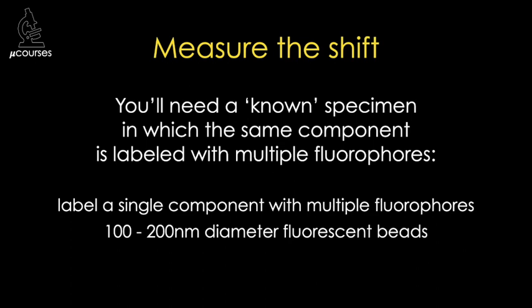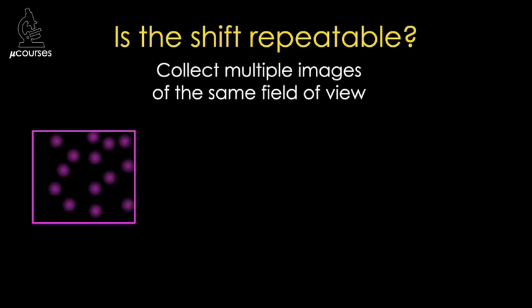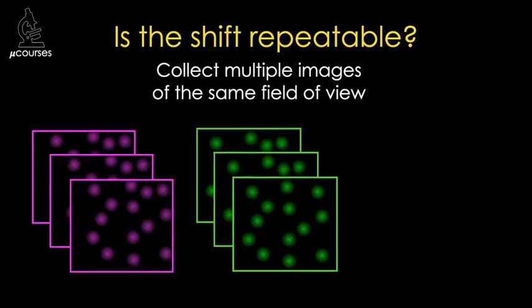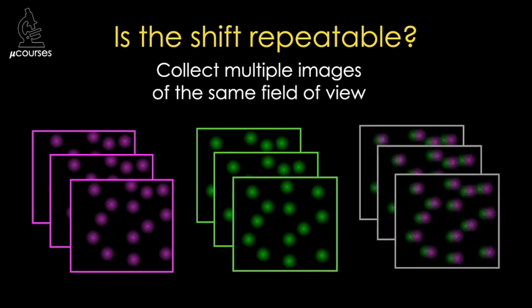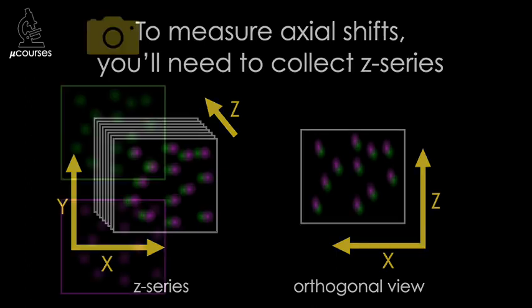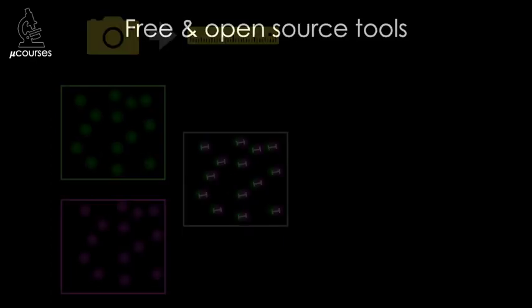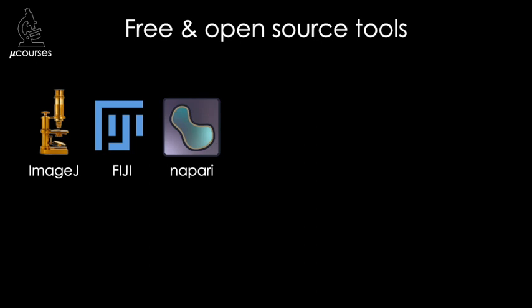Alternatively, you can purchase small beads that fluoresce in multiple wavelengths. To measure the shift, you'll take images of the test sample at each wavelength that you plan to use for your experiment. For the shift correction to work, the shift must be repeatable. To determine if it is, you'll need to take multiple images of the same field of view going back and forth between wavelengths — this will reveal if the shift is repeatable. You can use the same sample to measure axial chromatic shifts, which requires collecting multiple Z-series of the same field of view so you can measure the shift in the orthogonal view. After you've collected images of the shift, you'll need to measure it using free and open source analysis software such as ImageJ, Fiji, and Napari.